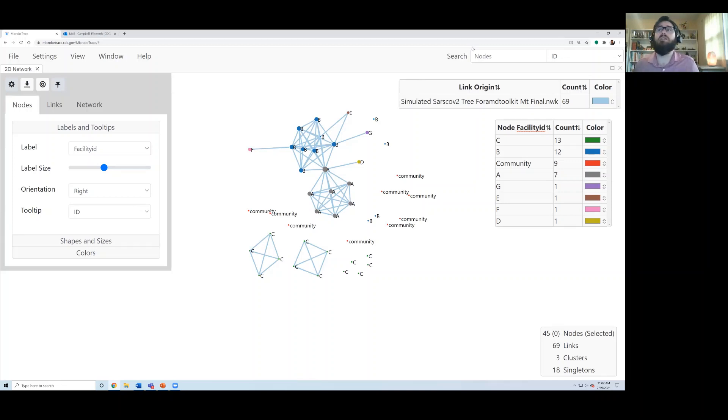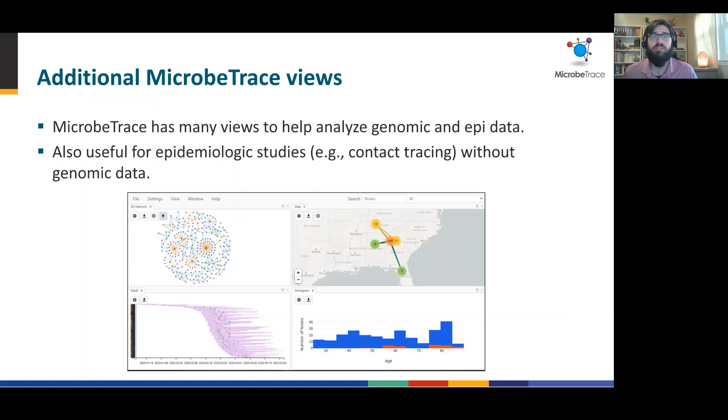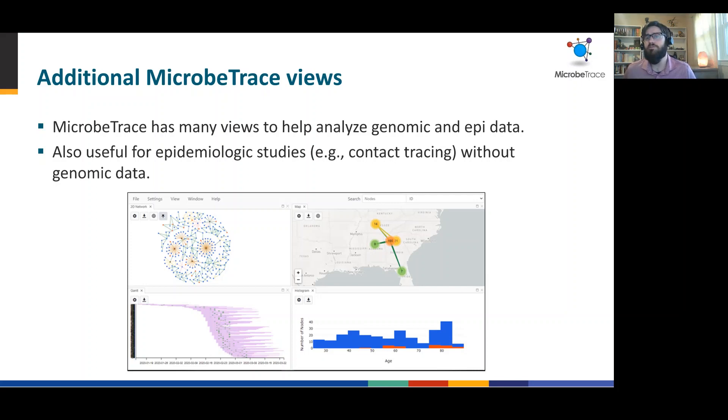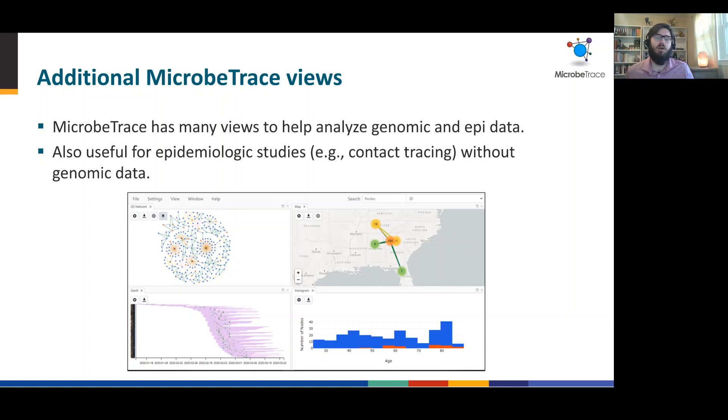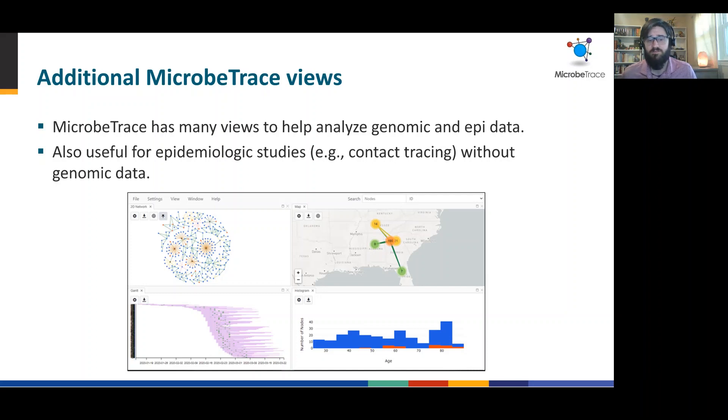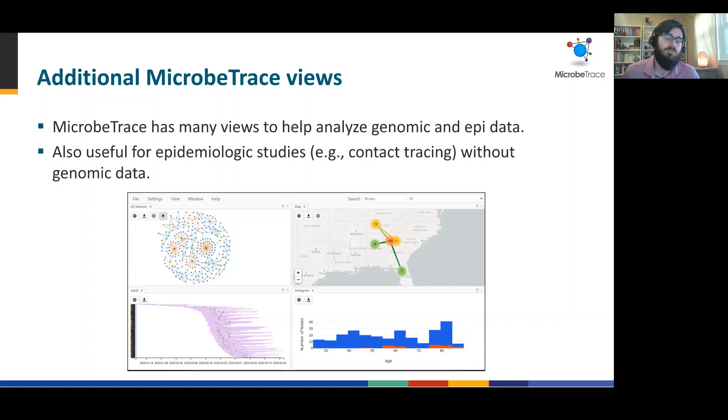And before we close, I want to describe some additional views that MicrobeTrace can provide that are very helpful in analyzing epi and genomic data together. For example, if you have data in the format of zip codes, latitude and longitude, or state and county, we can integrate your network with the map and overlay that on top of each other. If you have timeline data, you can show Gantt charts as we've shown in the bottom left to get an idea of duration and events along a period of time. We can also provide epi curves that aren't shown here, as well as histograms that allow you to very rapidly get an idea of an age distribution or something along those lines.